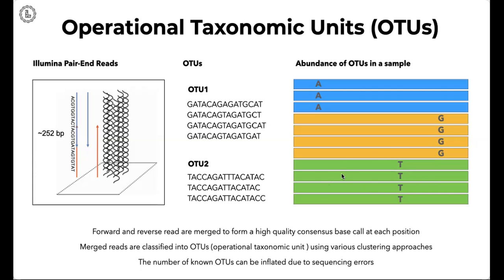This is an oversimplification; in reality we will have more than one marker position for several of these OTUs. Taxonomy can be assigned by comparing these marker positions, and generally the sequences of these OTUs, to the database.